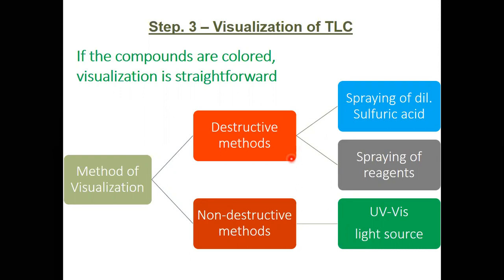There is no change in the sample compound, its behavior or its functional groups. The second one is the destructive method.